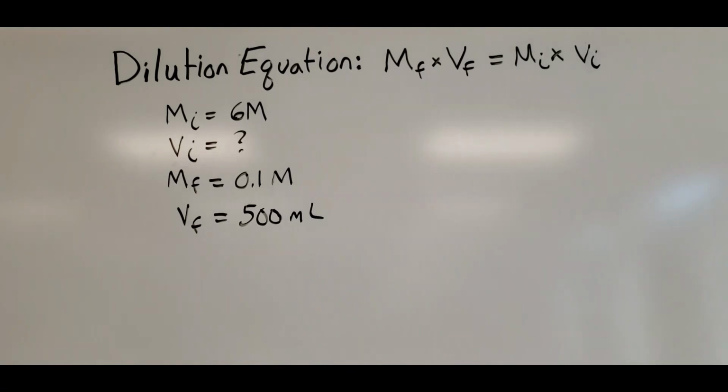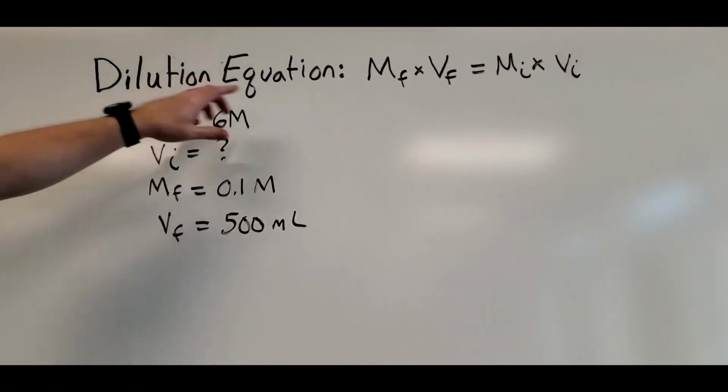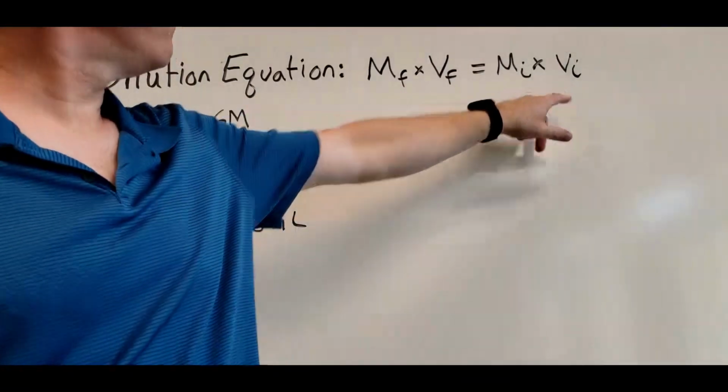So the first step says to calculate the volume of 6 molar sodium hydroxide required to prepare 500 mils of 0.1 molar NaOH. So we're going to use the dilution equation: final concentration times the final volume is equal to the initial concentration times the initial volume.